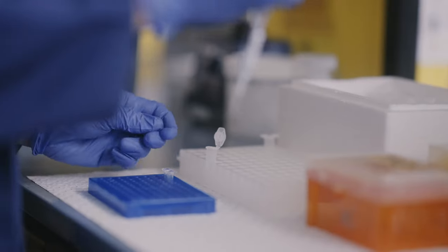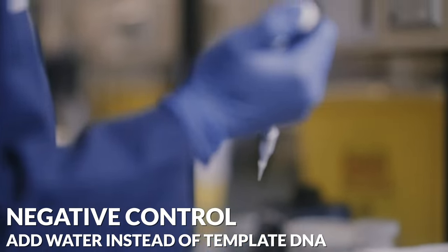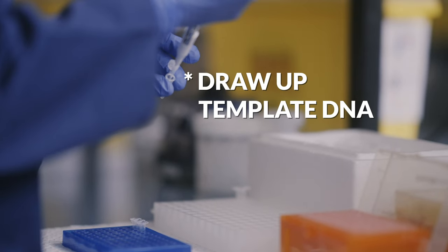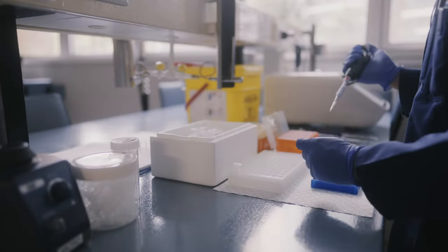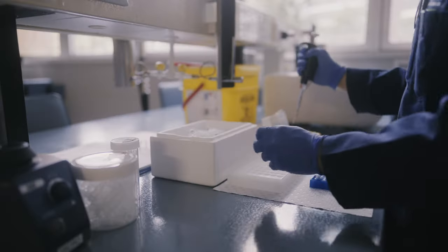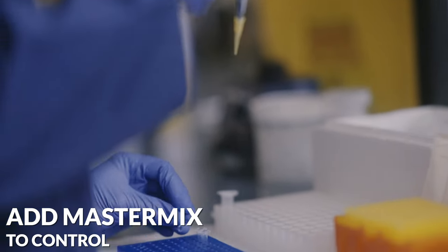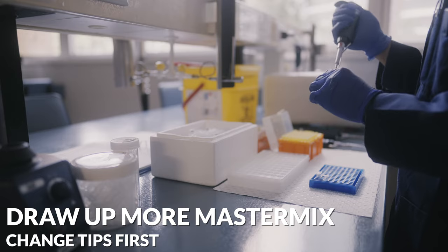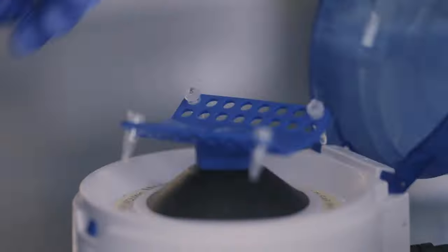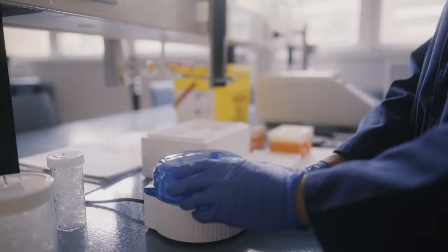We now set up the PCR reactions. First, a negative control without any template DNA. Then our test reaction where we add the template DNA — the genomic DNA isolated from the new bacterial strain. Once everything is added, we vortex the tubes again before putting the tubes into the thermocycler machine.